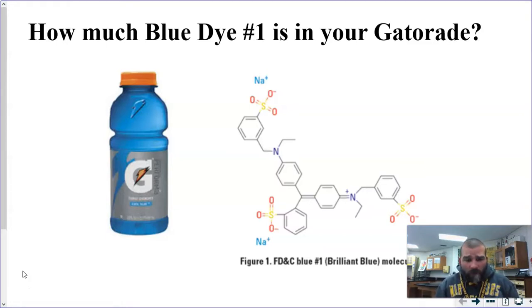But this is an important one because these techniques and skills that we learn from this lab are very necessary for a later lab this year in Unit 5. So hopefully by watching this video and going through the data and the worksheet that I have for you that goes along with this, we can make some sense of it and conclude what we're trying to figure out here.